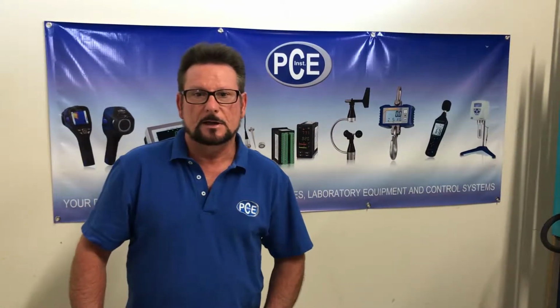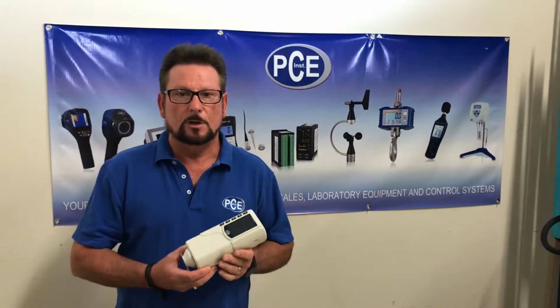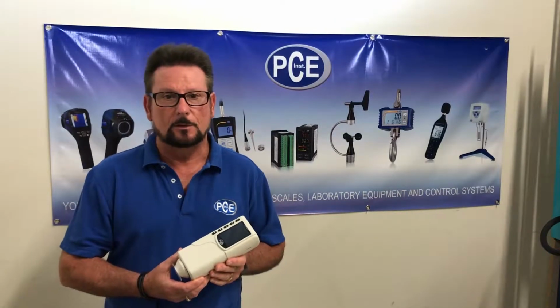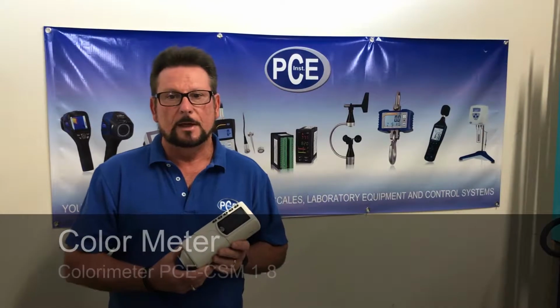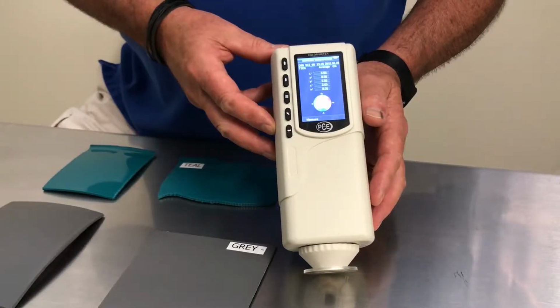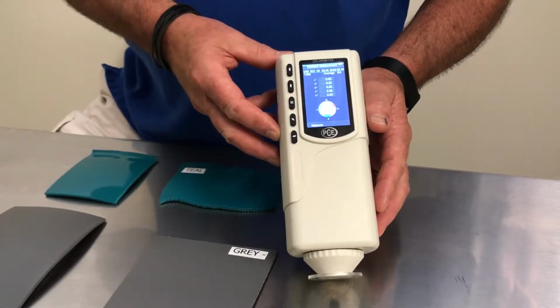Today we would like to discuss how to enter the master color standards into your color meter to be compared against the samples for pass-fail. The instructions are for PCE-CSM 1 through 8 color meters. We have already programmed the meter with the date and time settings.